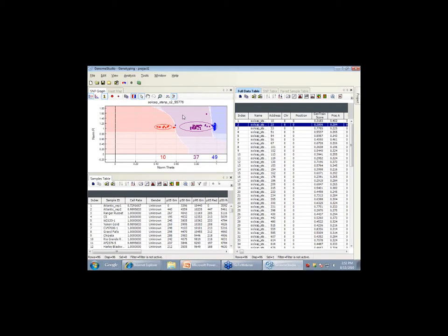Okay, so the question is, what kind of data are we looking at? The data that we're talking about is a set of 96 SNPs that we developed with the SolCAP project to validate how good our SNP detection algorithms are. And so you'll get this. What's unique about all data sets is basically how the SNPs are defined. That's the first thing you need to know.